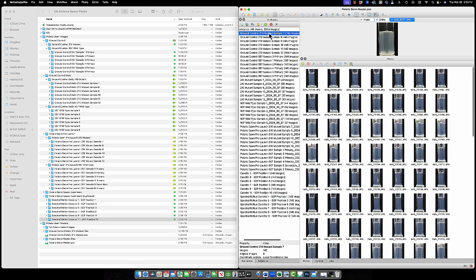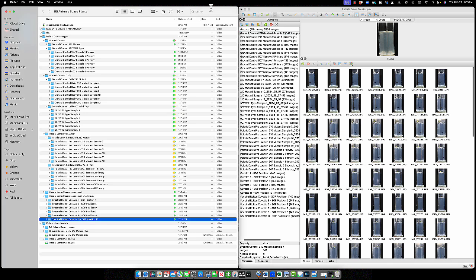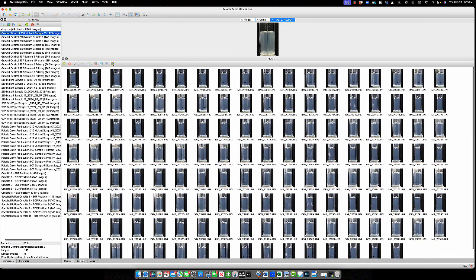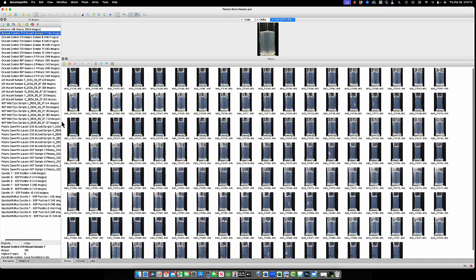The next step is to make sure that the lens information is correct. So for each of these, what I'm going to do now is minimize the main directory, because now all of our data is in Metashape. I'm also going to hit that save button there just to make sure that I save my work. This is a lot of data. Sometimes your computer might not be able to handle all this. It's always good to save your work real fast, or at least your progress.